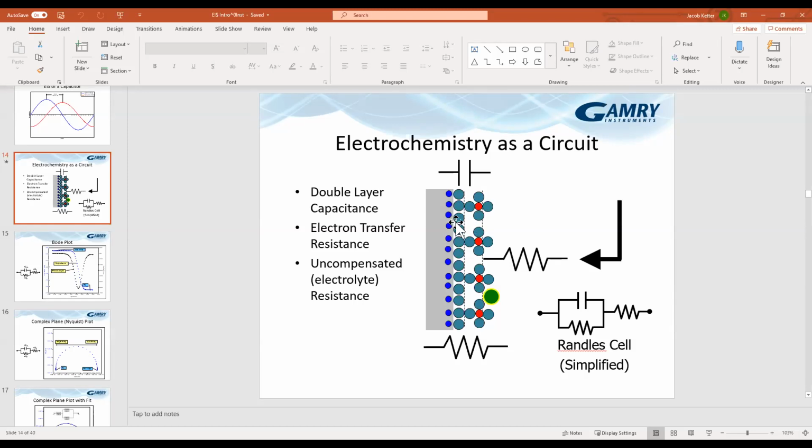When you polish your electrode, if your surface roughness is less than 1 nanometer, I would be astounded, right? Most of the polishing pastes cut off at maybe 100 or so nanometers. I think you can get some alumina slurries that are down in the 10 to 50 nanometer range. But with those polishing slurries, you end up with surface roughness that's on the order, if you're really, really lucky, of single digit to maybe 8 to probably 30 or 40, 50 nanometers.